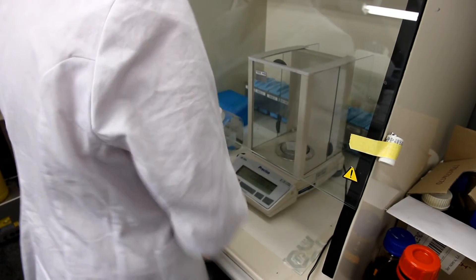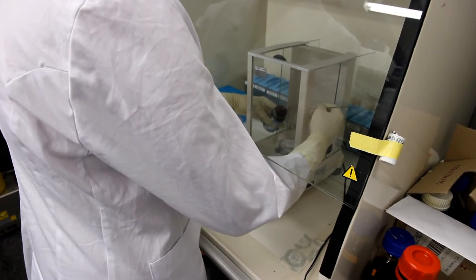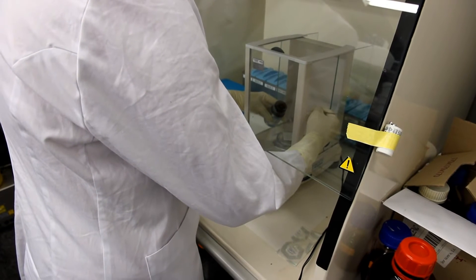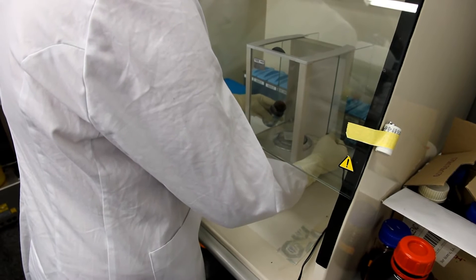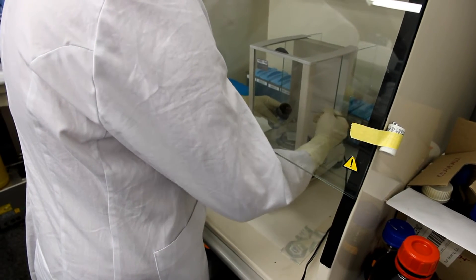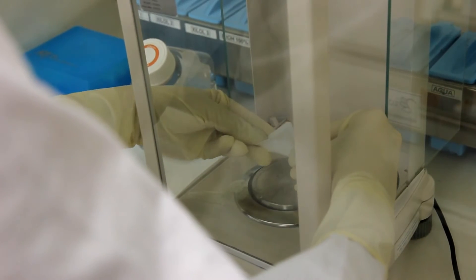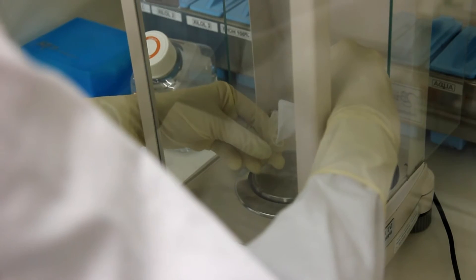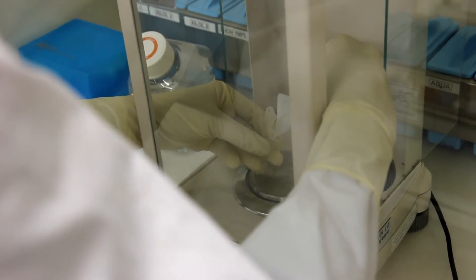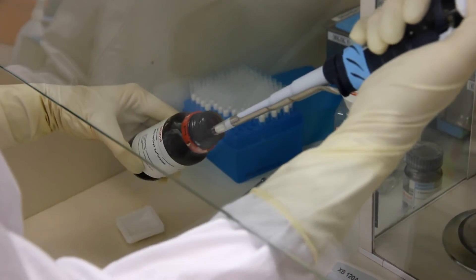Proceed by weighing enough busulfan for the preparation of a stock of 4 mg per ml. Consider the number of mice to be treated and assume that the approximate volume to be injected per mouse will be around 300 microliters in a dose of 40 mg per kilogram. The dose required to cause germ cell depletion must be optimized for the mouse strain and can range from 40 to 60 mg per kilogram. Once weighed, busulfan should be dissolved in equal volume of DMSO first and then water.